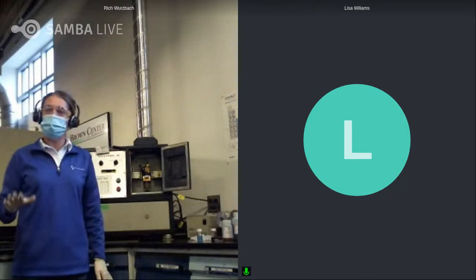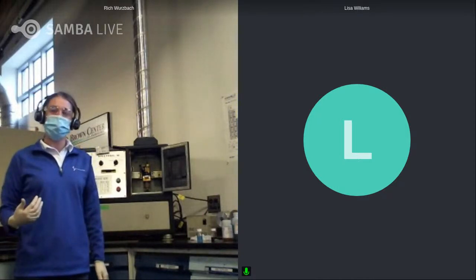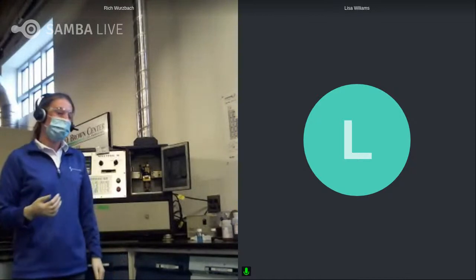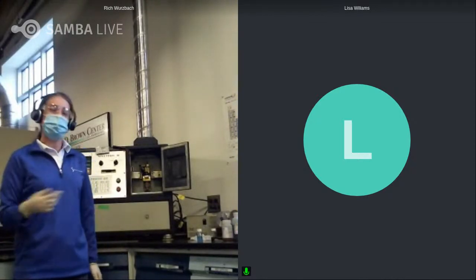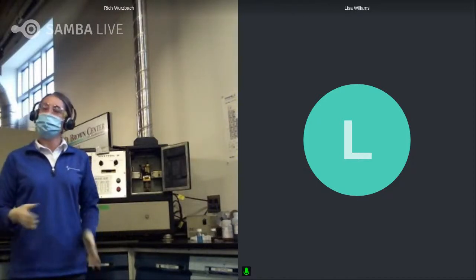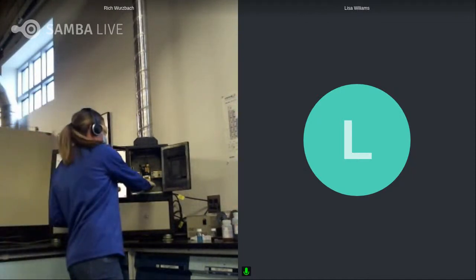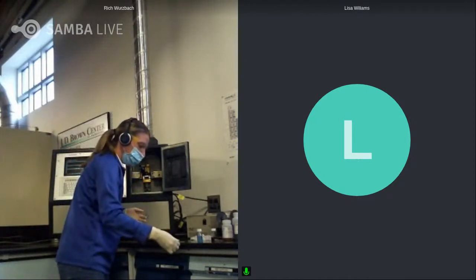So each time we run a grease sample through and create that flame, one, we don't touch the parts right away because they are going to be hot. Two, we want to make sure we dispose of our mineral spirits properly. We don't just want to pitch them in the trash, just like with oil. And three, we want to make sure we wipe down our chamber really, really well because we created more soot than we normally do. So I'm going to show you how to do that now, and then we'll be ready to go and all done.